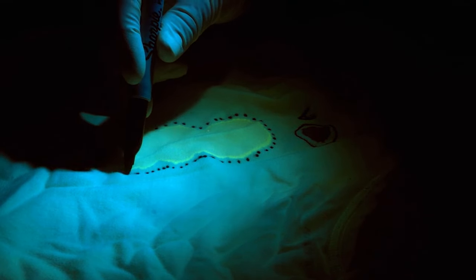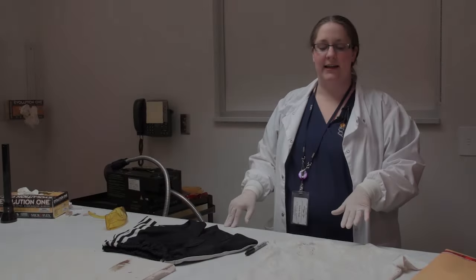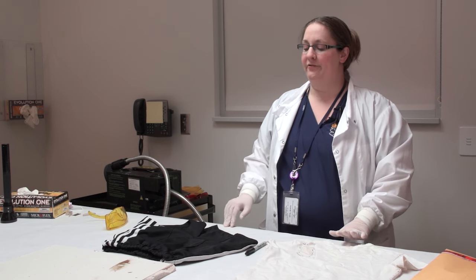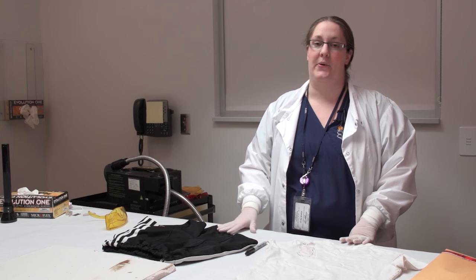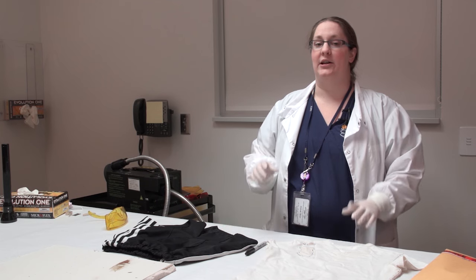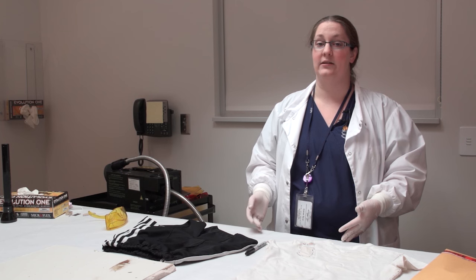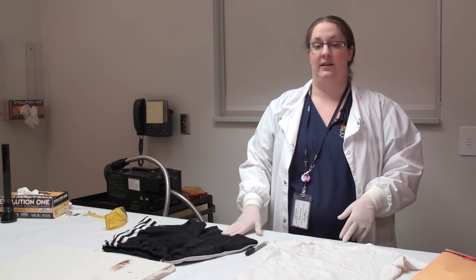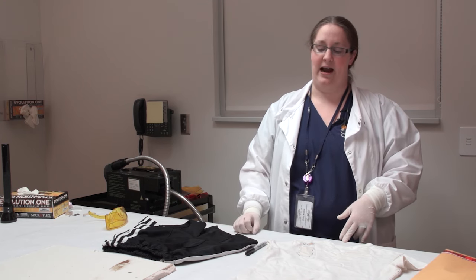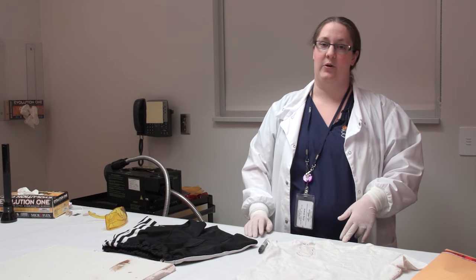It was very easy to see the stains on the nice white shirt. Unfortunately, it's a little bit more difficult when you have a darker type fabric like this black. When we're searching something like this, we might try different wavelengths of light on the ALS to see if we are visualizing any stains. When we have a dark fabric like this, we're probably going to use something like a silver Sharpie that would actually show up on the black fabric instead of a black marker, which won't show up. That'll help us identify which stains we're going to test.